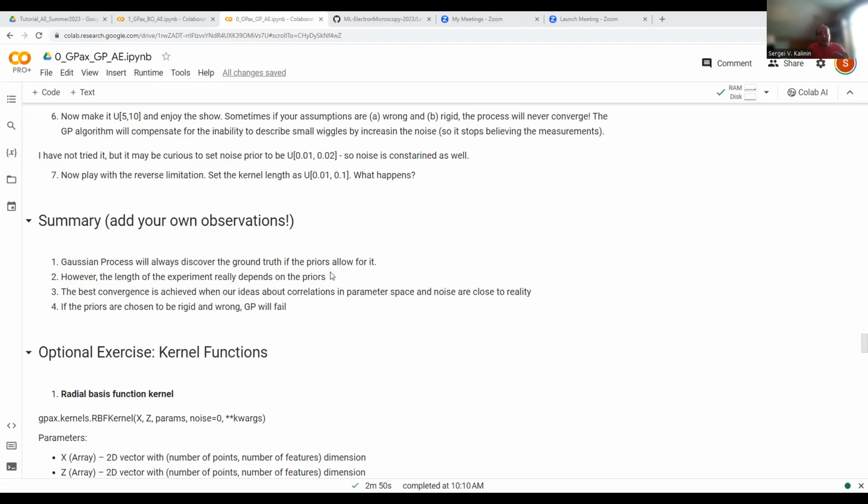So generally, if you want to build the workflows that allow you to use the Gaussian processing for automated experiment, you start with always running the algorithms on the problem where you know the ground truth, which is kind of close to what you expect to get during the experiment. You tune the parameters for this problem, not precisely, within maybe half order of magnitude, and then you expect that these parameters will work well during the experiment. That's the best you can do.